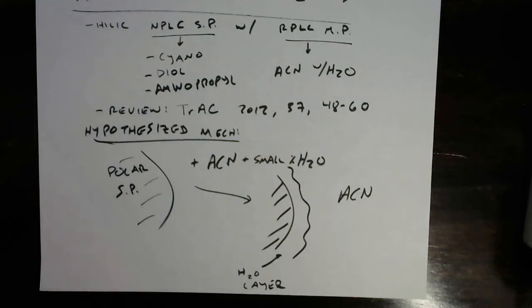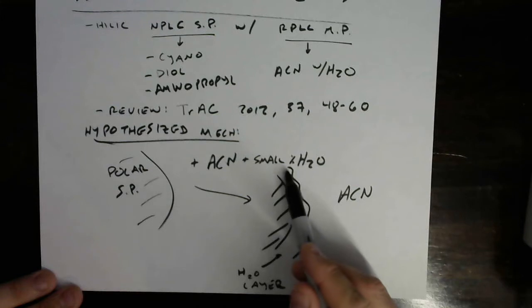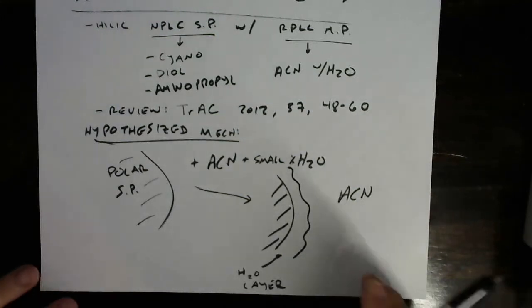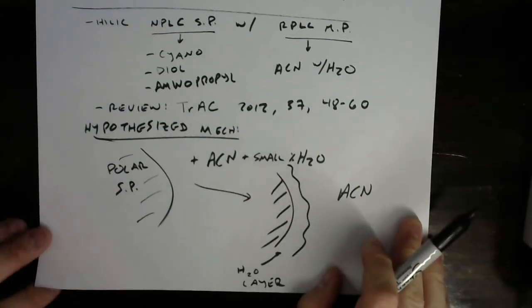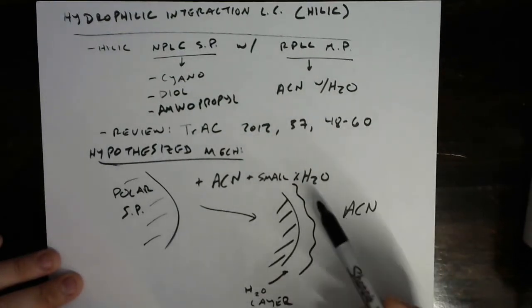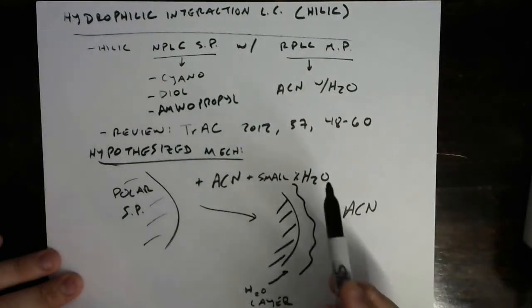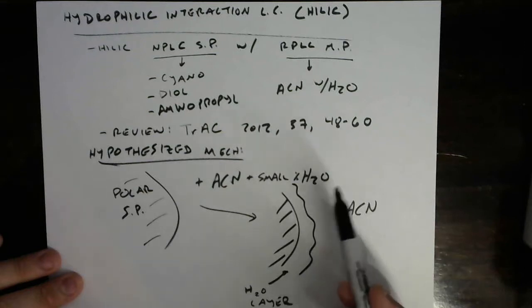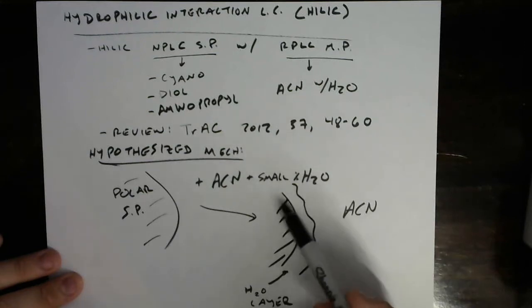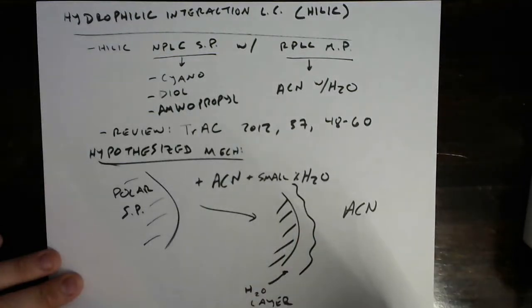So it's kind of a neat concept actually that what you've done is you've taken the surface of this particle and you've sort of wrapped it with a liquid. It's not all that different from what Martin and Synge did. The two main differences are this kind of wraps around the particle instead of being kind of impregnated within the particle, and that's good. That means that you get good mass transfer at the surface of the particle instead of having to penetrate into the depths of the particle.